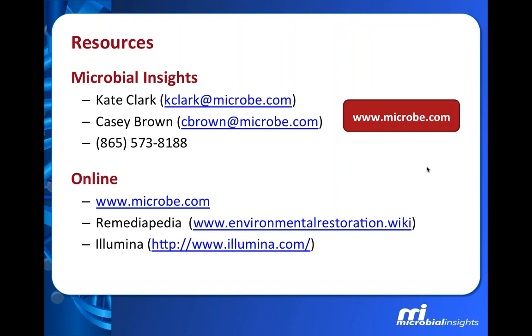So you can get some biases from the amplification process, which is another reason we'd like to move to the shotgun sequencing, because we eliminate that bias when we're talking about metagenomics. We're just looking at the DNA. We don't have that amplification step in there. But unfortunately for now, yes, there can be some biases that are associated with it, and it can cause us to underestimate bacterial populations, depending on the sequence design.